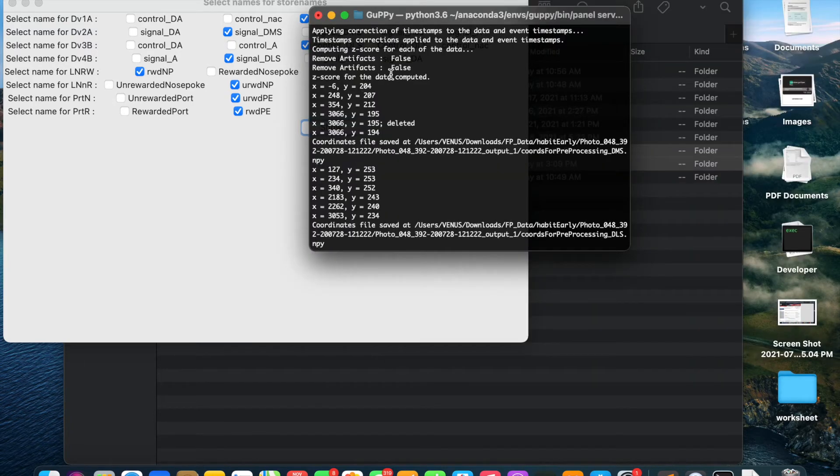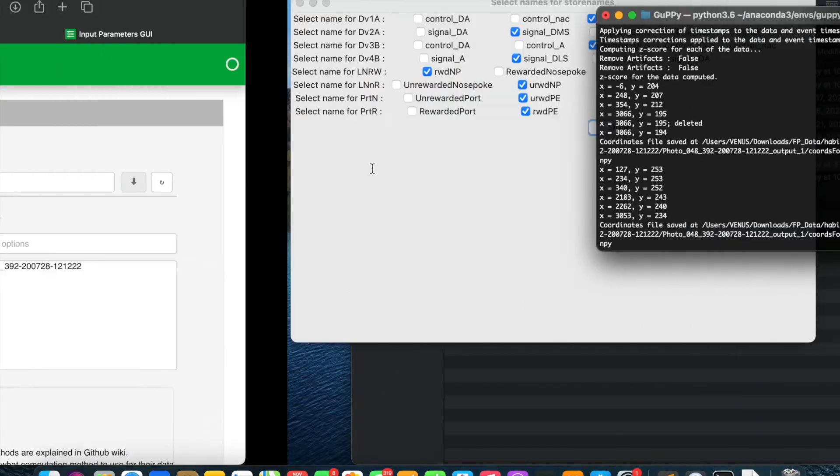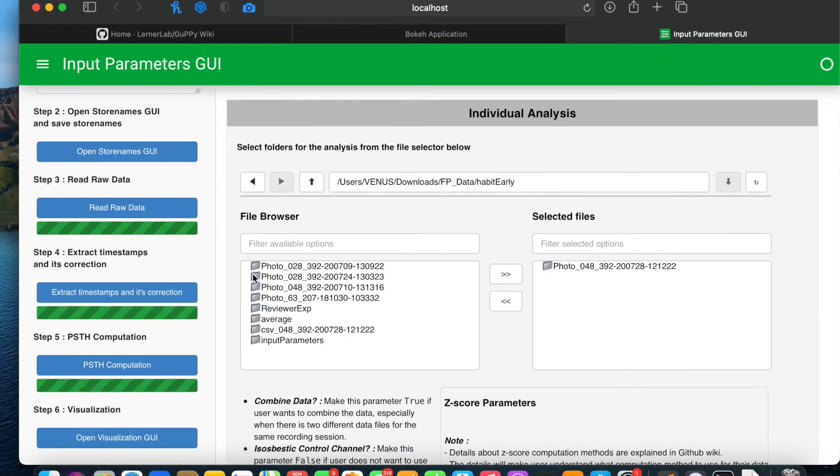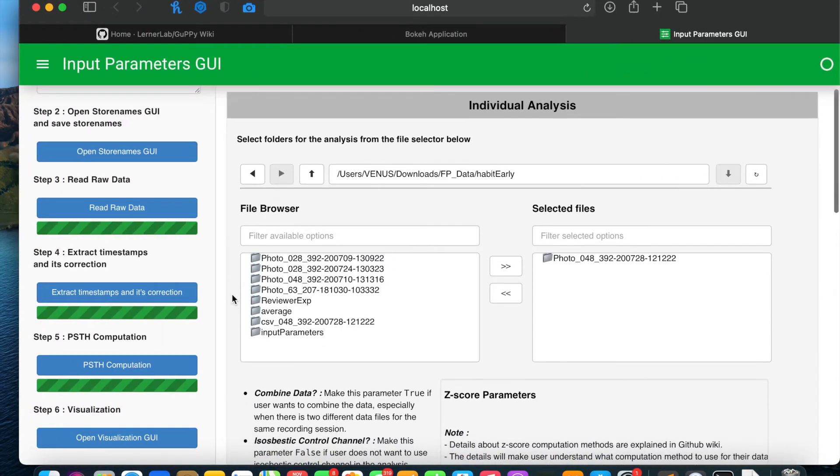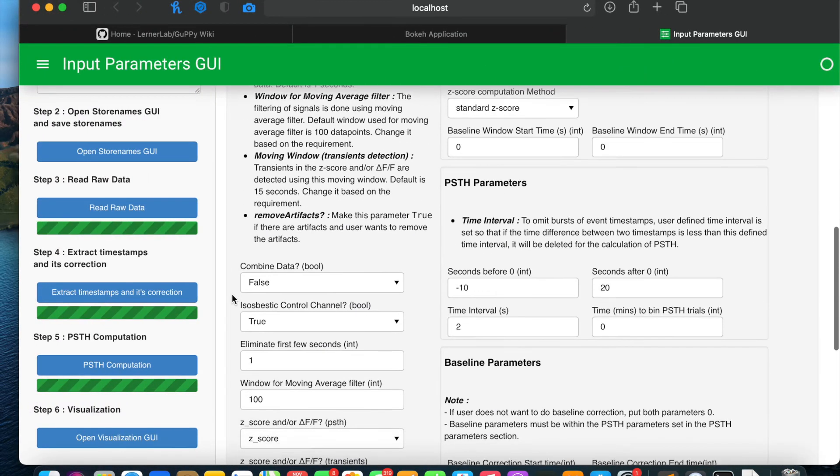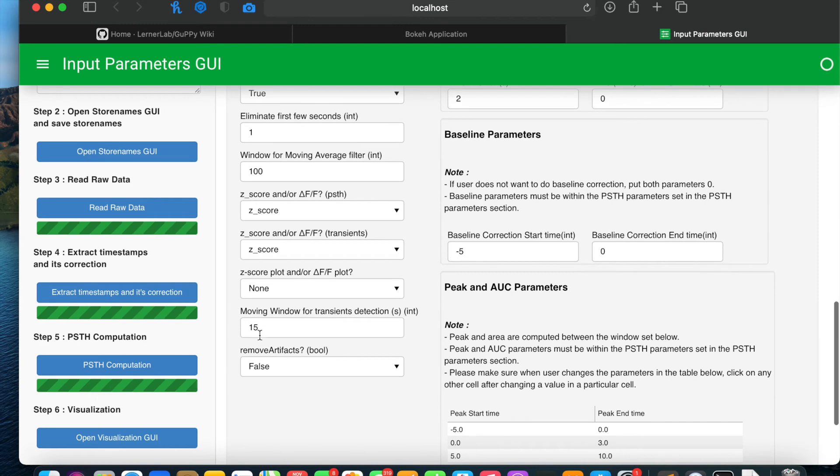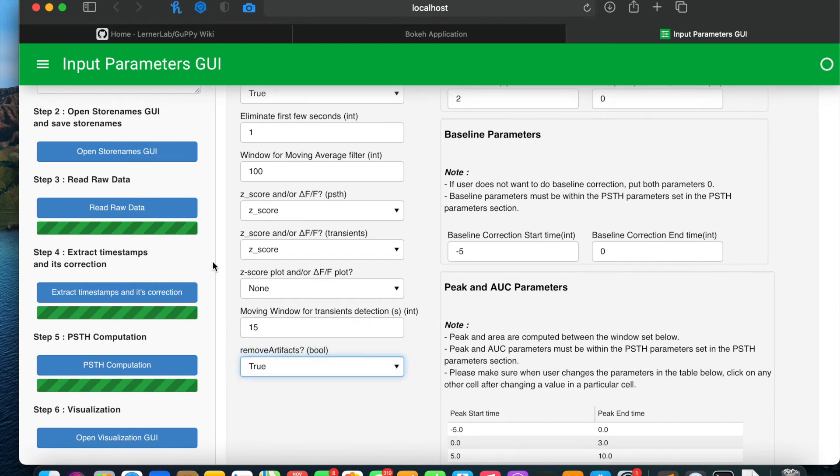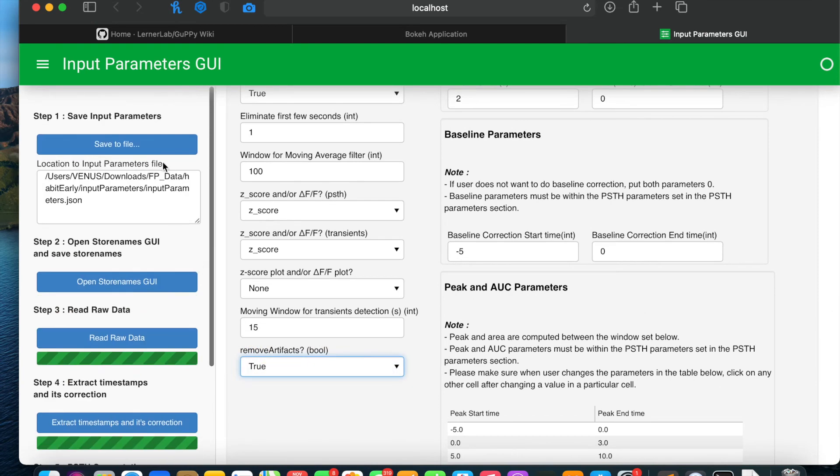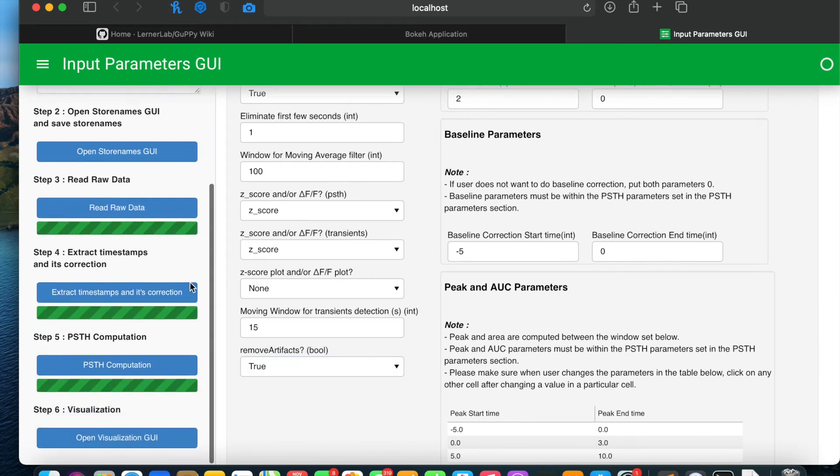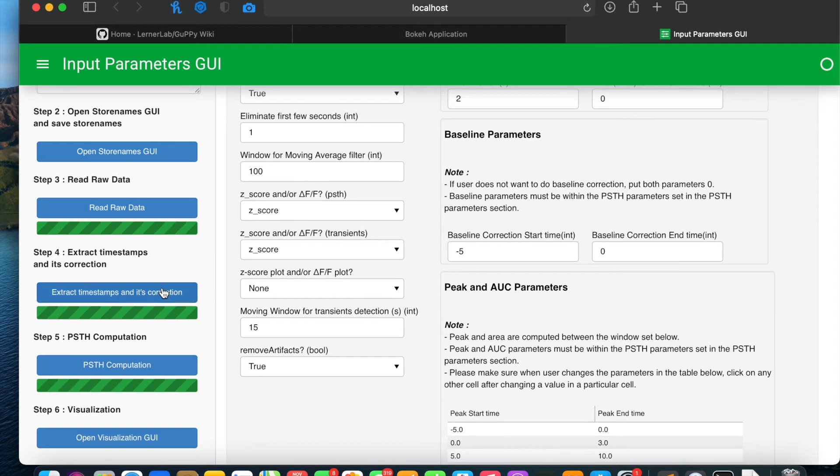After the selection of these chunks and saving it to a file, we will look to the main window and set remove artifact parameter to true, save it to a file and run extract timestamps and its correction step again.